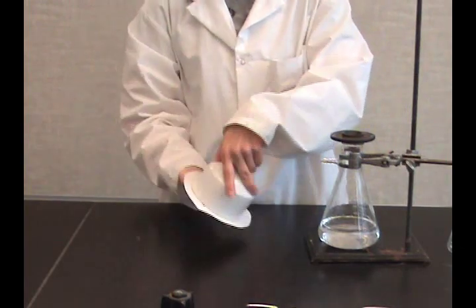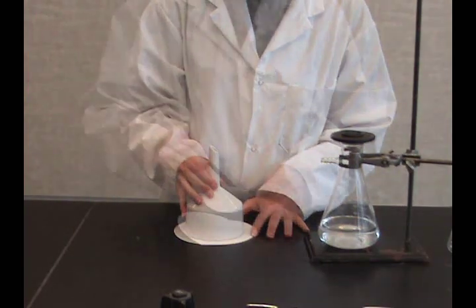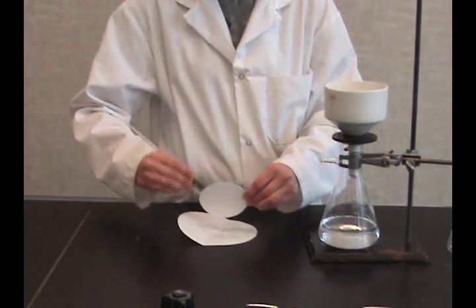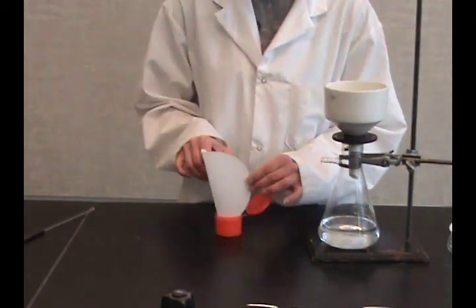Place it on top of the funnel and flip the funnel over. All the crystals and used filter paper will fall onto the larger one. Transfer to the collecting vessel.